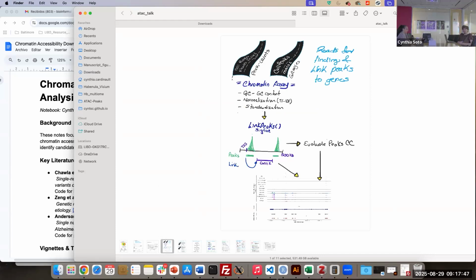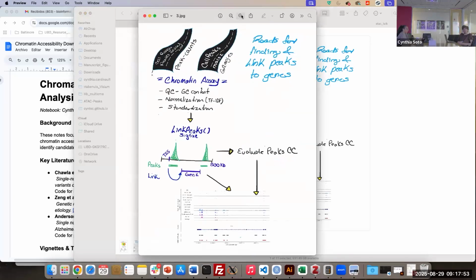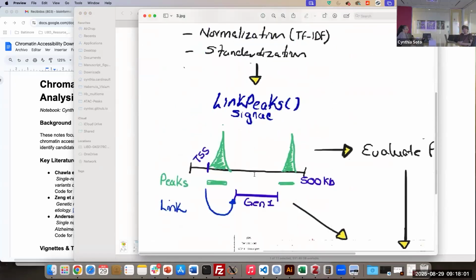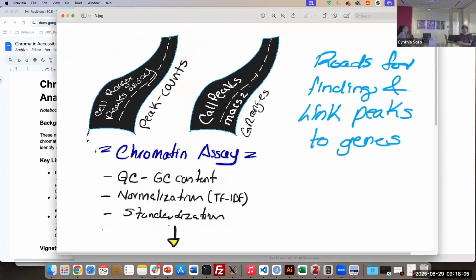So what happened here? What happened here is that we have different ways to do this. For example, I'm going to focus on making evident that you can track peaks from CellRanger. We have two roads: the CellRanger-ARC peaks, or we can produce our own peaks. If we want to produce our peaks, we are going to need to use a package like CallPeaks, that is the one that we are going to use as an example, that is wrapped in Signac.